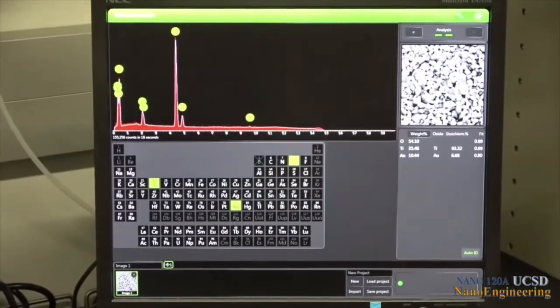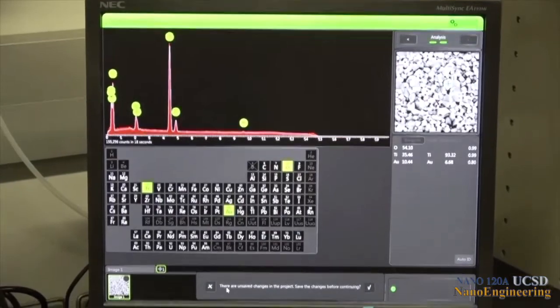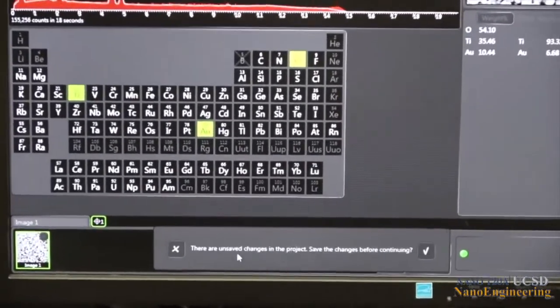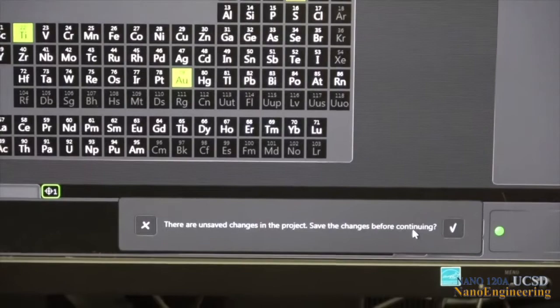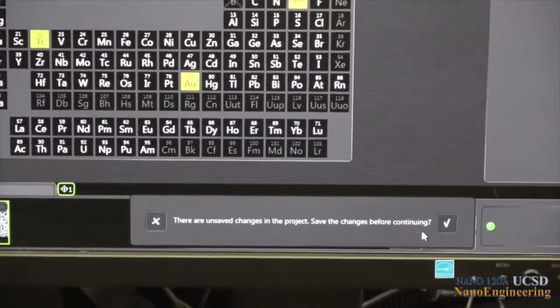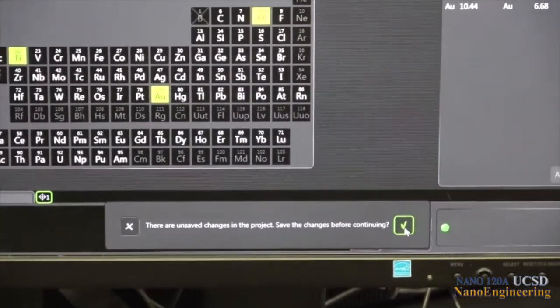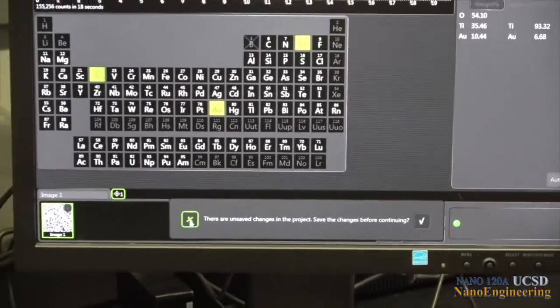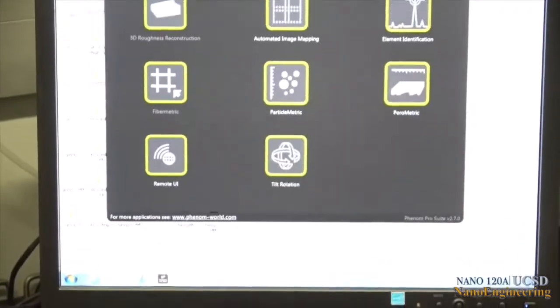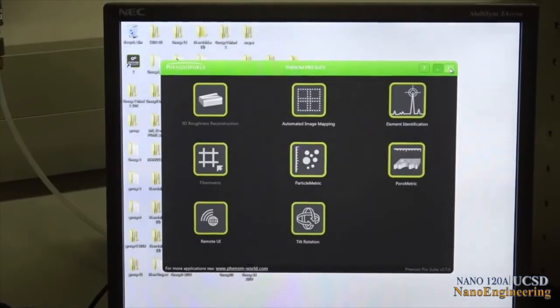To shut down the tool, move the arrow to the upper right corner of the screen and click. A message appears at the bottom that you have unsaved data. If you want to save the EDS data, click on the check mark that appears in this message. If not, click on the X as shown. This will take you to the Phenom ProSuite screen where you can exit out of that as well.